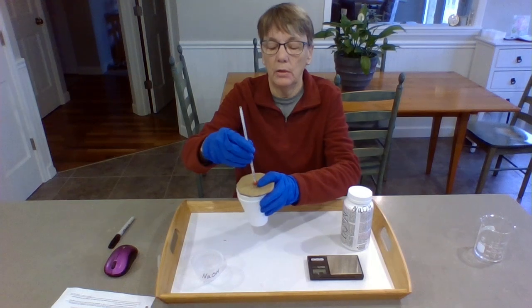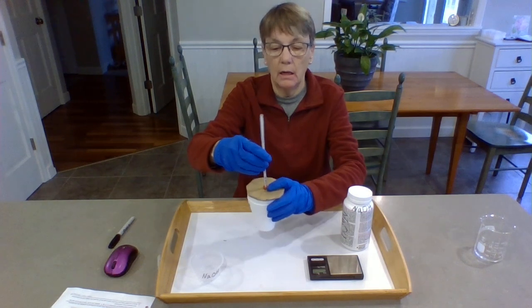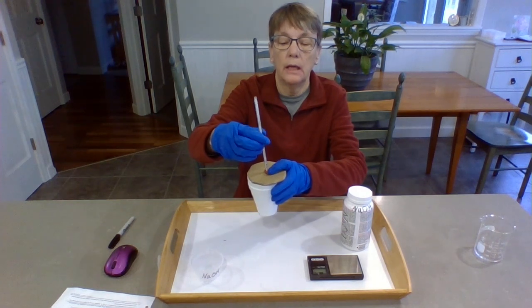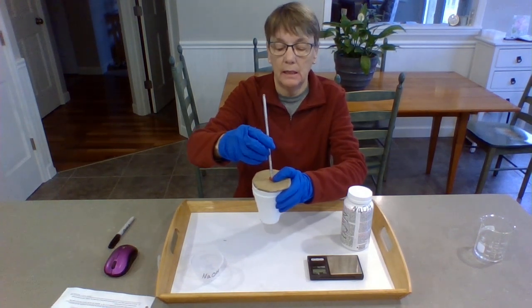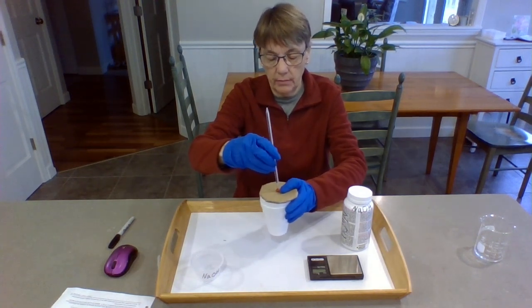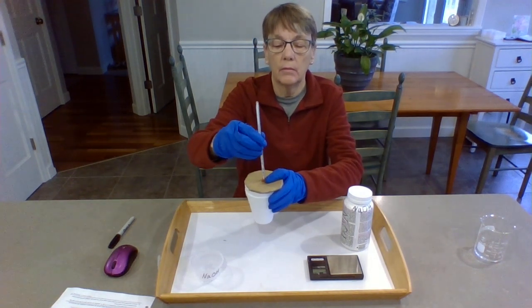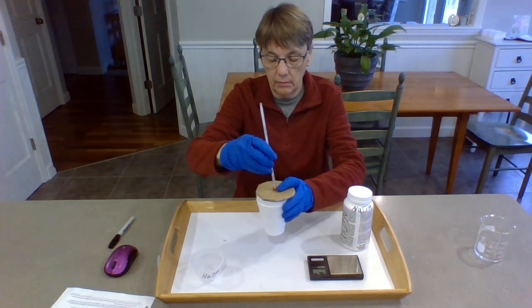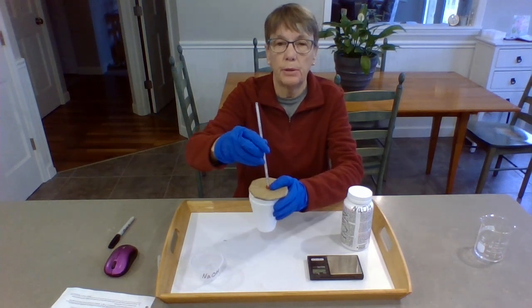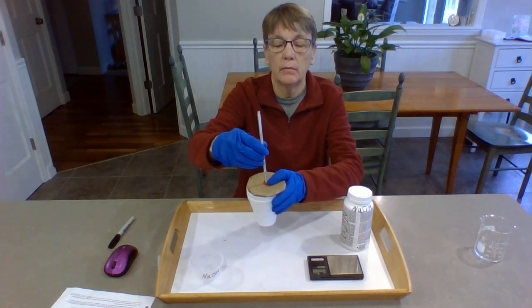Just pointing out a few sources of error here. I've got a couple drops that fell into my tray. Whoops. And also, if the lid comes off, that allows some heat to escape. We're up to 27.5. Looks like it's pretty much stopped, maybe going back down. Let me wait another minute maybe.